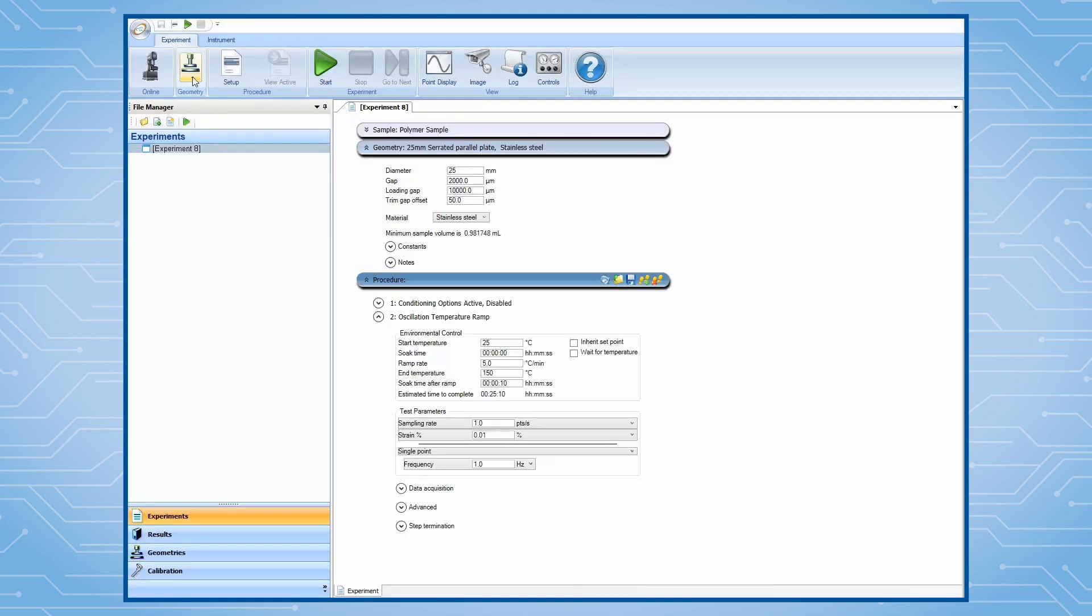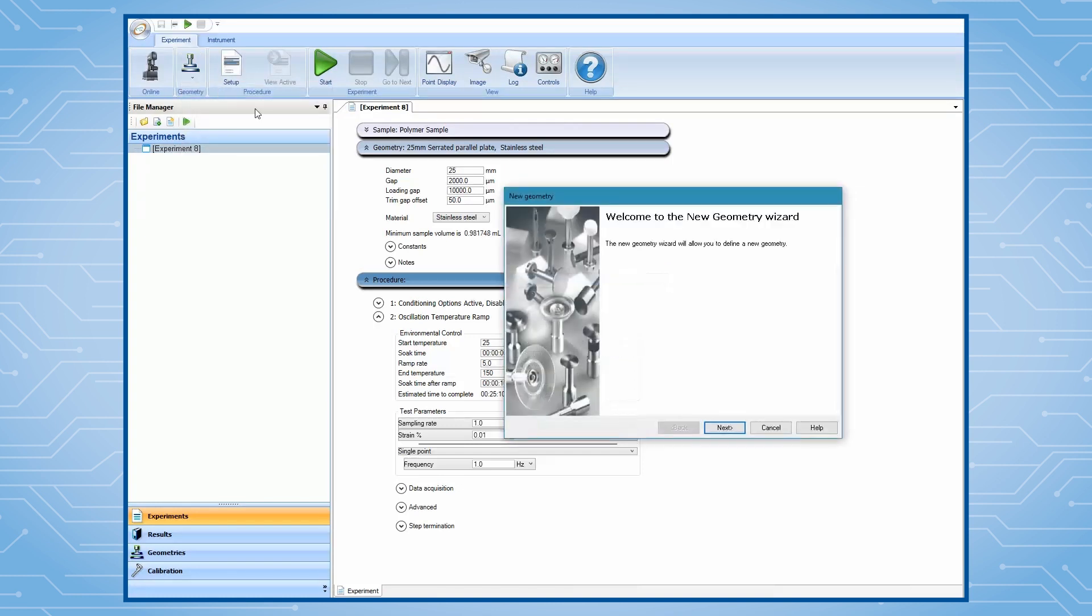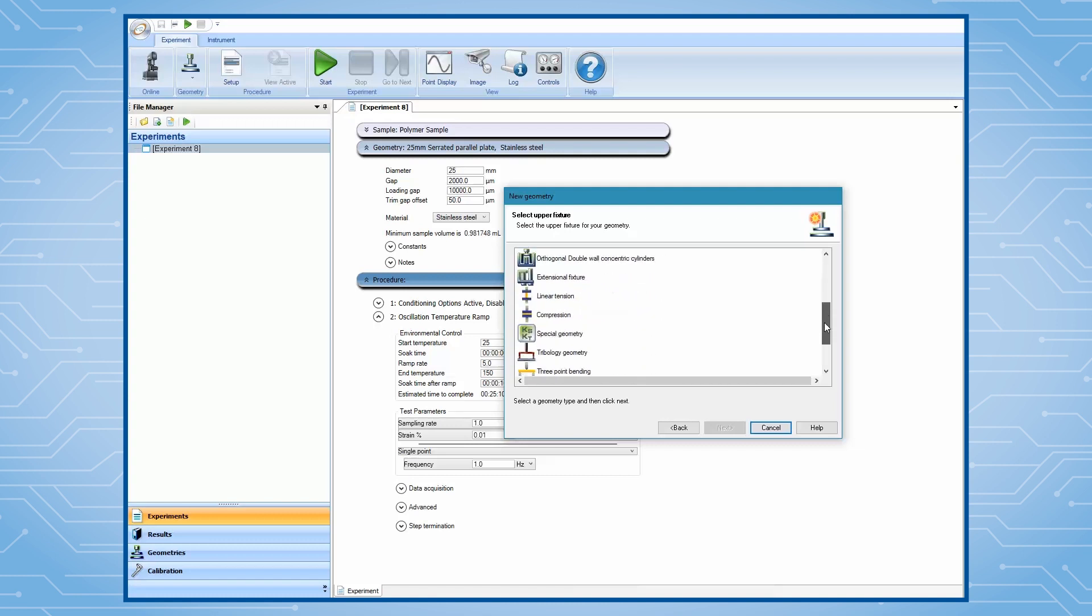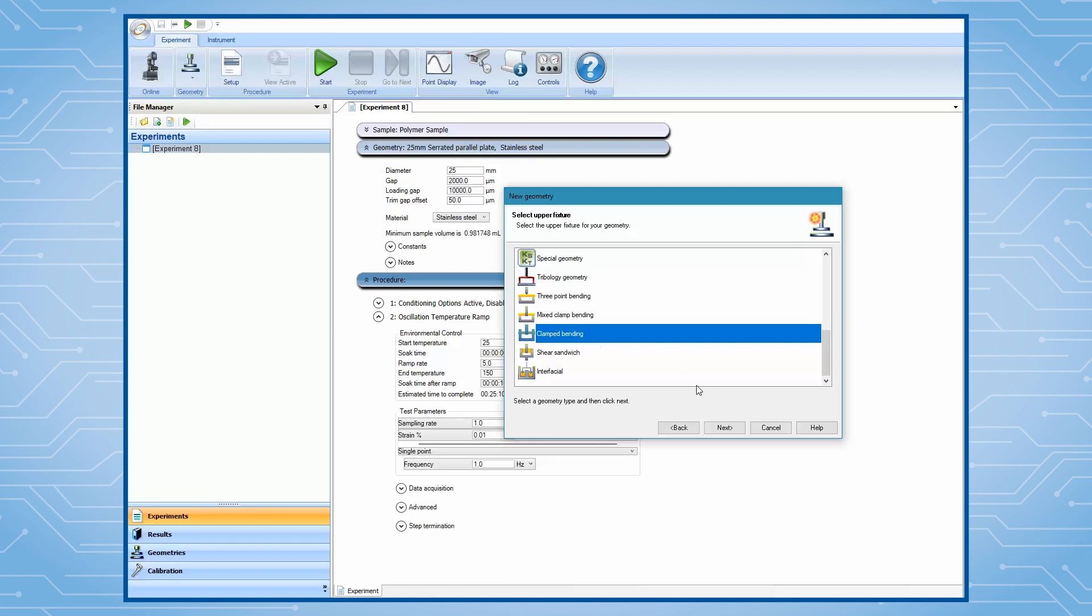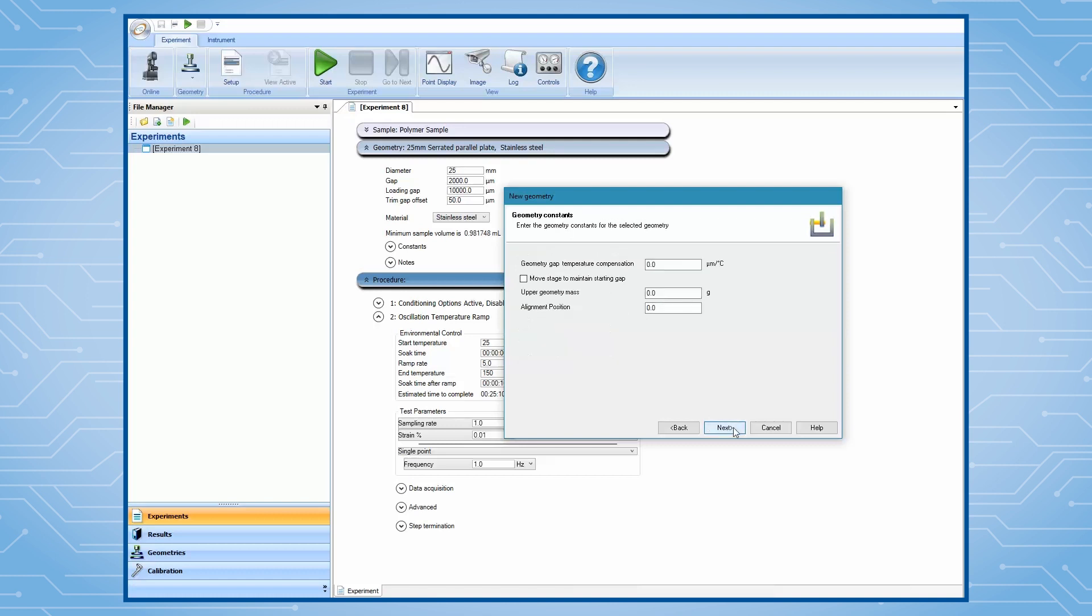If this geometry file has not been previously created, then select Add New Geometry. Choose Clamped Bending from the list, then click on Next. Choose the type of clamp you want to use, for example, dual cantilever.